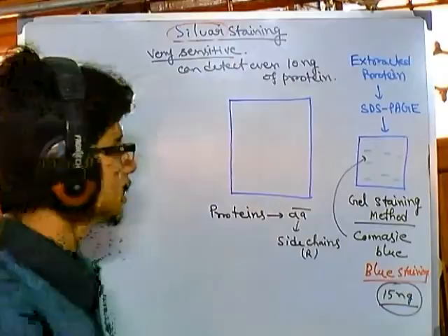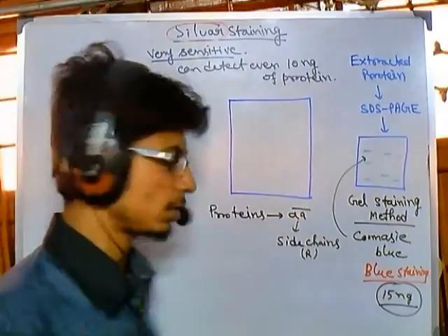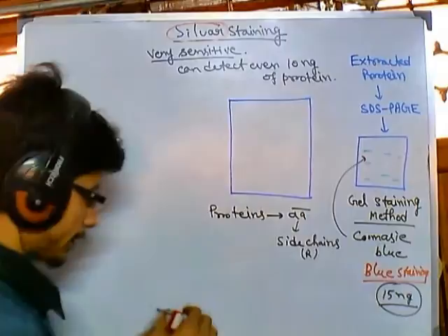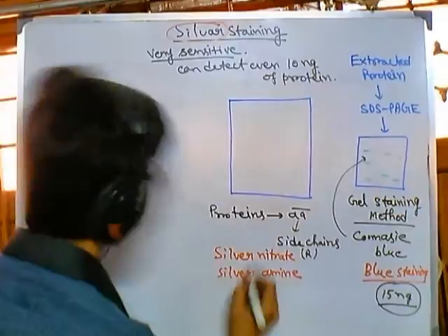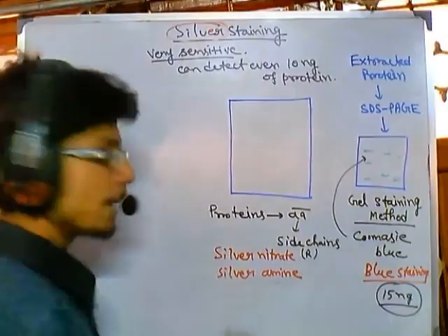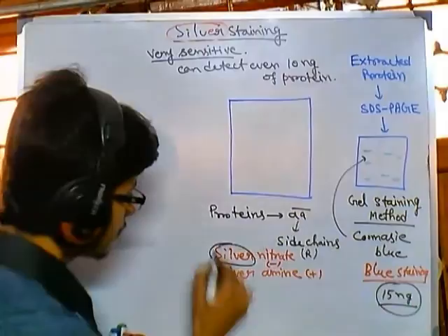Now whatever we take, silver nitrate or silver amine, whatever stain we get, we have silver in it, right? Silver amine is a positive type of staining, and silver nitrate is a negative type of stain. But whether it is silver nitrate or silver amine, the major component of this stain is the silver.